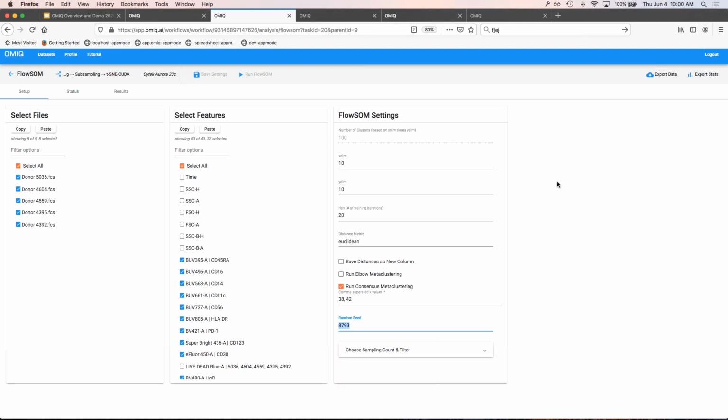If you're thinking about an organization, usually for companies, you'll have an IT group and they have standard questionnaires. They'll give us this questionnaire, we'll fill it out, and then we'll be good to go. So there's standard processes for that at most companies. Most universities, it's very different. Some academic groups don't seem to care all that much, or it's just sort of make sure the basics are in place. Others have their own IT groups that do audits of our security standards. So I hope that answers the question.